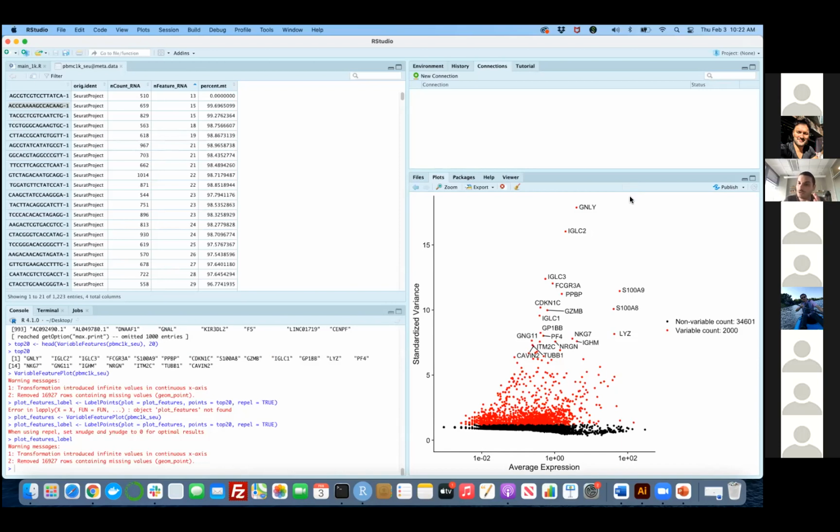So what we will be doing is testing all these genes, but we're just using these top variable genes for clustering purposes. The marker analysis, or you can call it differential expression analysis too, in this case, is just independent of that process. So everything that we do here, we are doing before clustering. Does that answer your question?